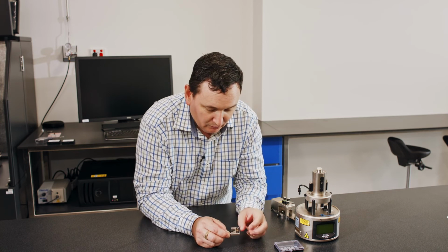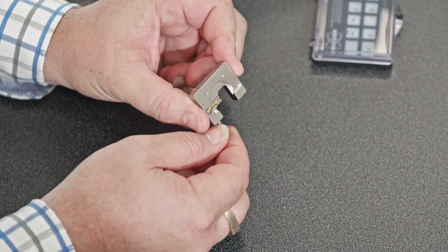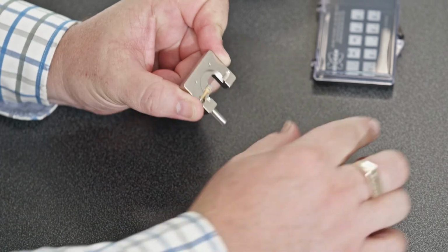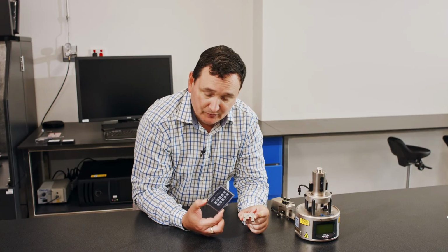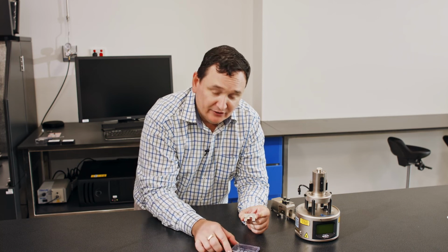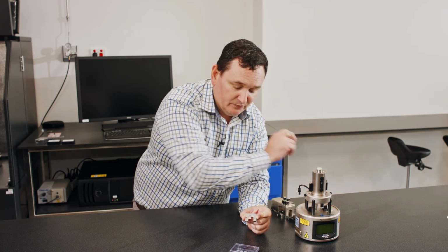So the probe holder, if we flip it over, our probe holder here has a gold clip which presses down onto the surface of one of our cantilever chips. The big part that we can see is called a chip. Hanging out the end of that is a cantilever, and then underneath touching the surface is the tip. That's the nomenclature that we use.